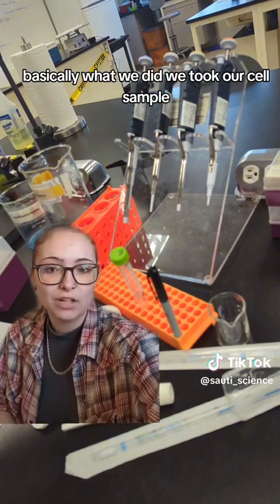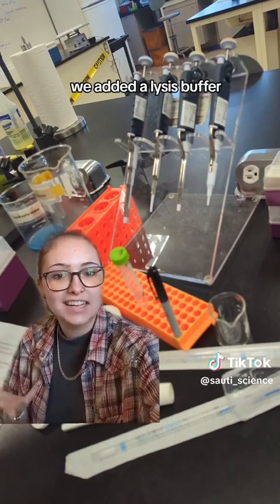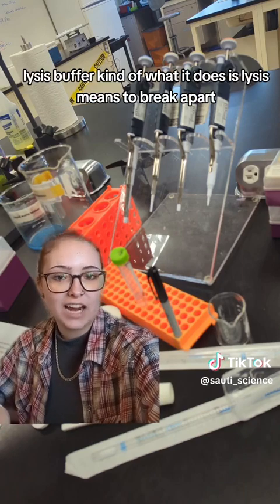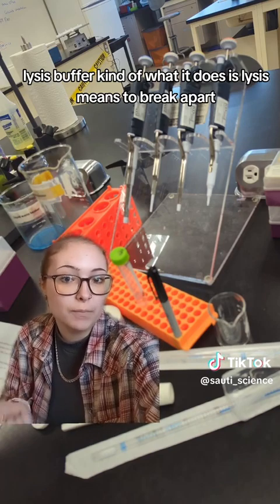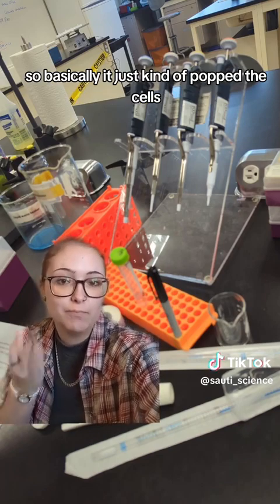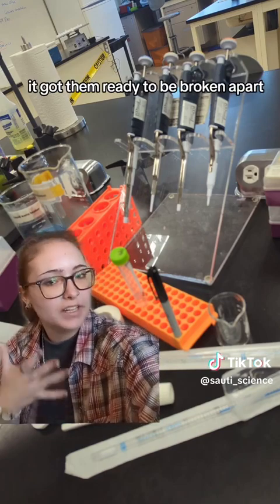We took our cell sample and allowed it to thaw because it was stored frozen. Once it was thawed, we added a lysis buffer. Lysis means to break apart, so basically it just kind of popped the cells — it got them ready to be broken apart.